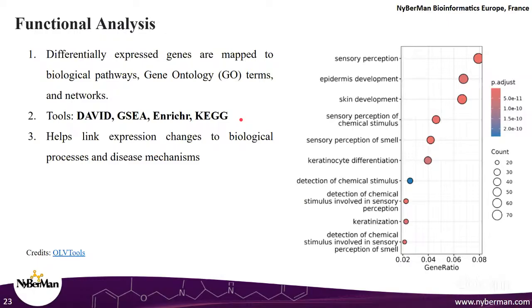And finally, when we have a list of differentially expressed genes, we can choose to do an n number of different things. What we will be focusing on in this internship is something known as functional analysis, where we will group the genes according to their biological functions and pathways and figure out what are the particular biological pathways and functions which are getting differentially disrupted in our condition as compared to the control.